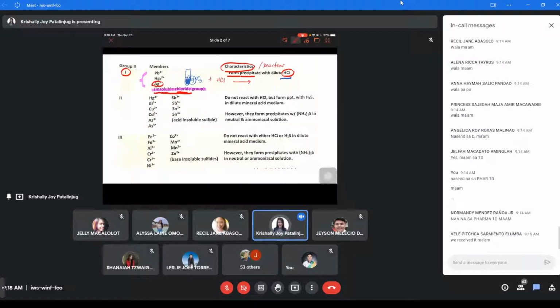And what is the precipitate that will form? Just criss-cross it, it is a double displacement reaction. So apply the double displacement concept. You will form the precipitate silver chloride, yes. And the byproduct, which is in solution form, is nitric acid. It is just an application of double displacement. You go back to your notes on how to predict products for double displacement.